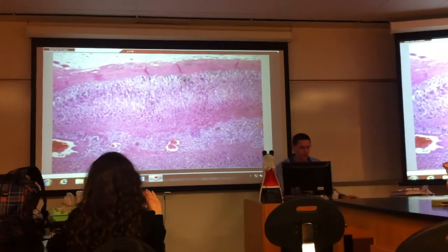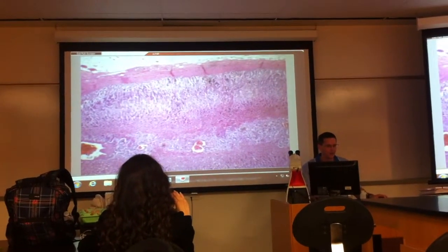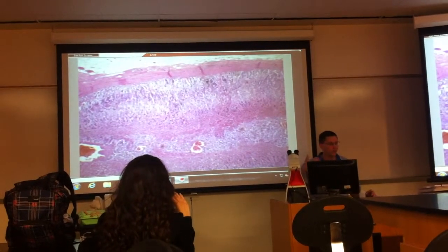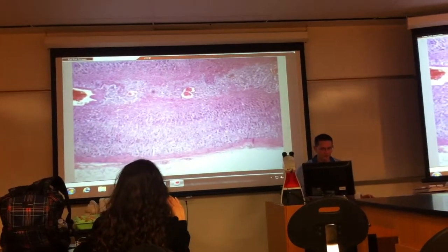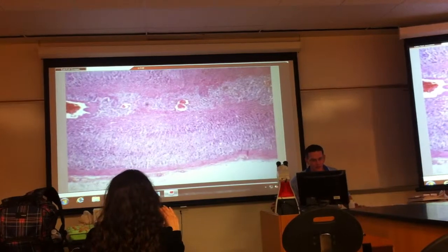And again, so you have an outside and an inside, and we'll talk more about this in a second. But the adrenal cortex is going to be the outer layer, so it's actually from here to there. I'll tell you how I can tell that in a second. And adrenal medulla is the middle layer, and that's just right down here. So in other words, this is going to repeat. That is, you're going to have cortex, medulla, and then cortex again. So if I scoot down this direction, right, that's still medulla there. This is adrenal cortex again. You see capsule again. So just pay attention to where you are.